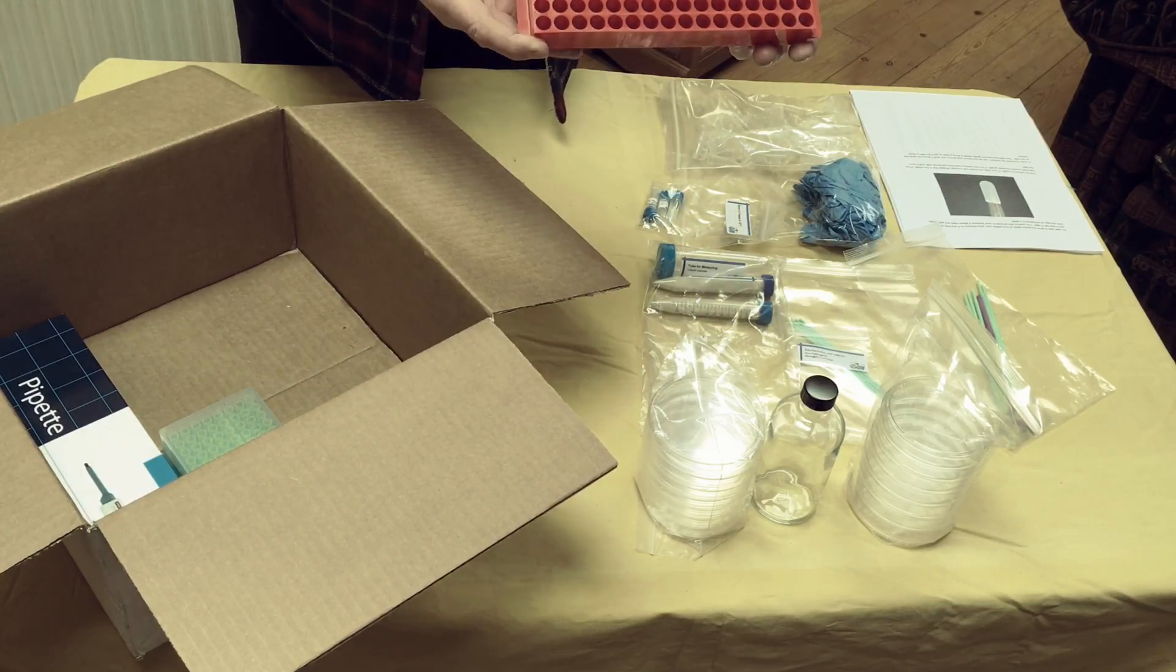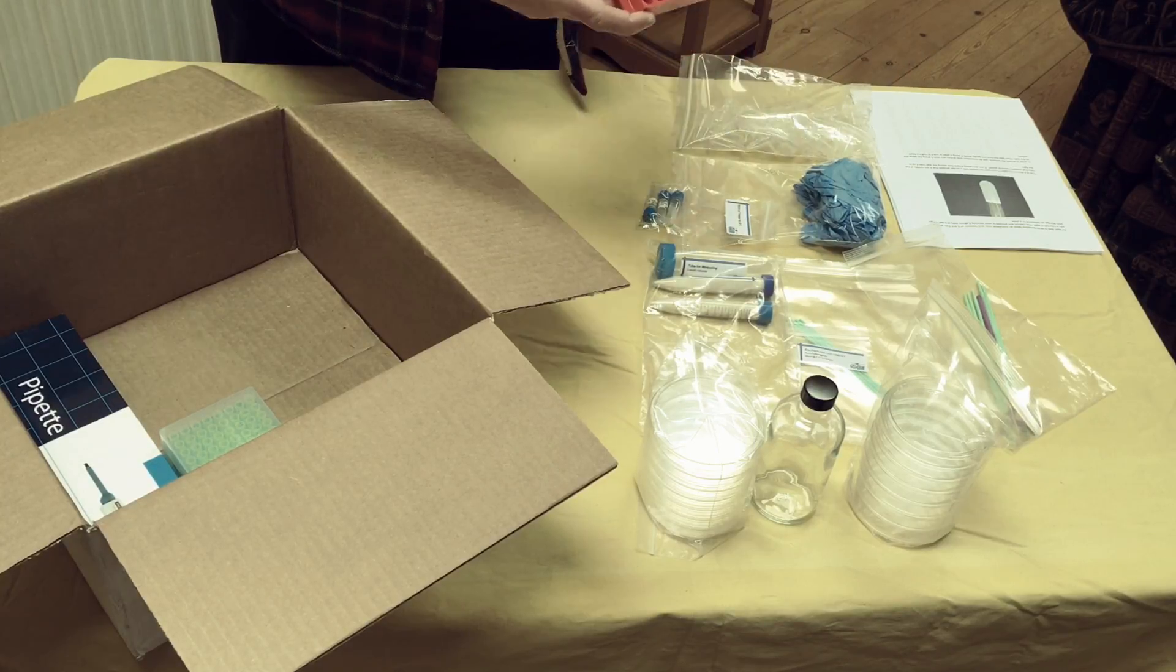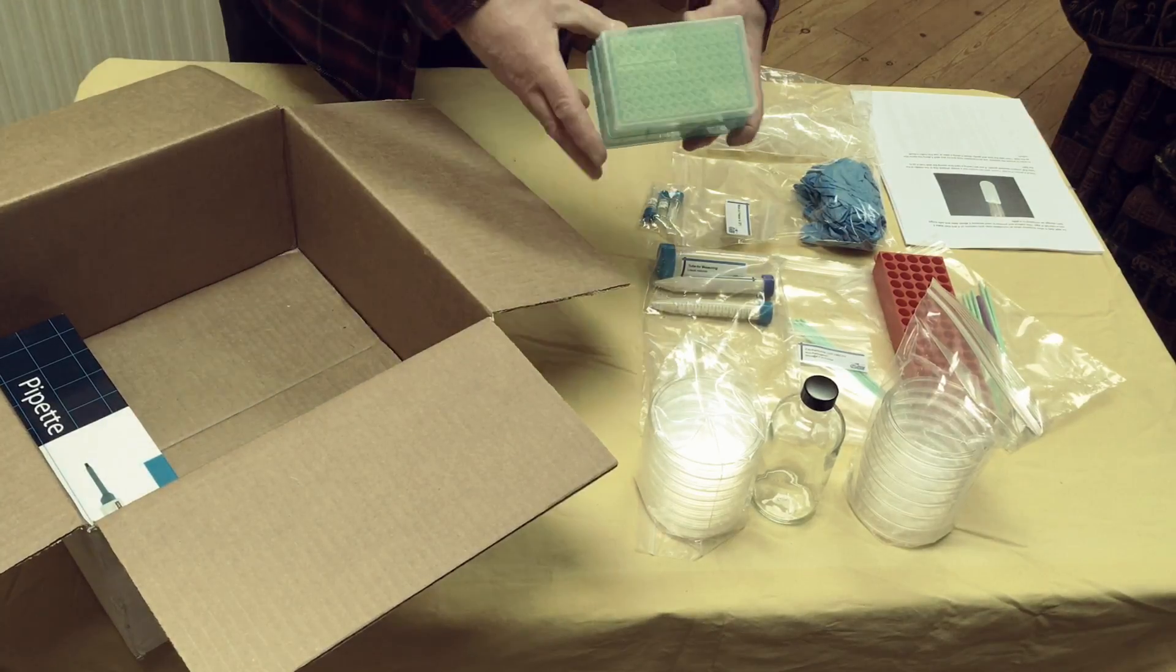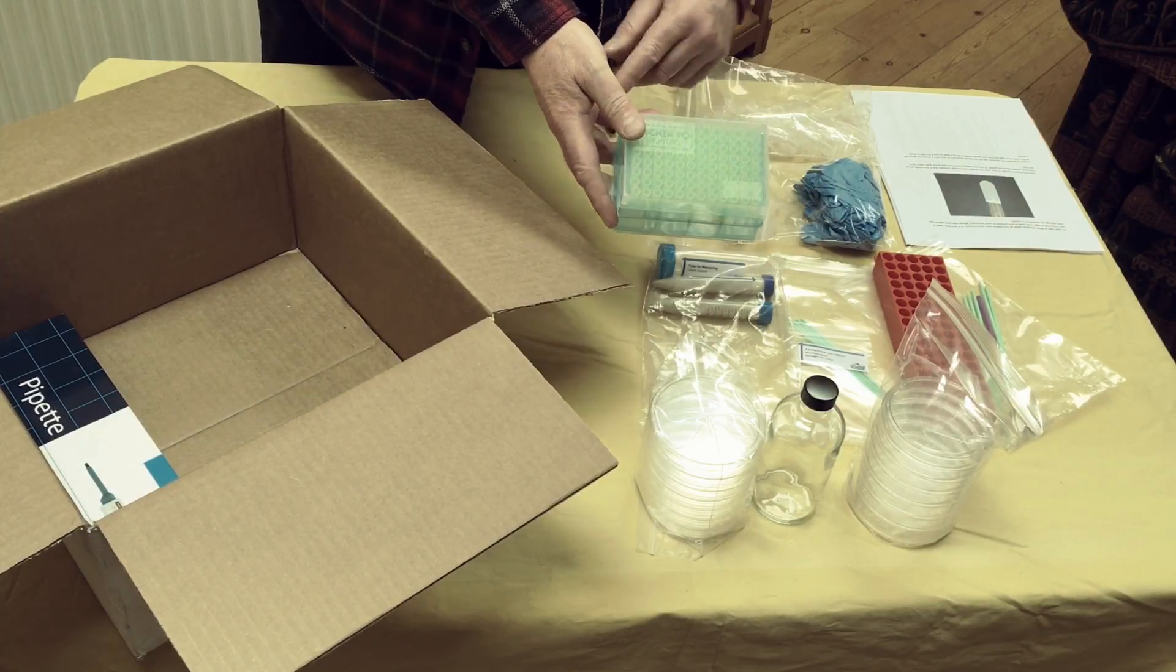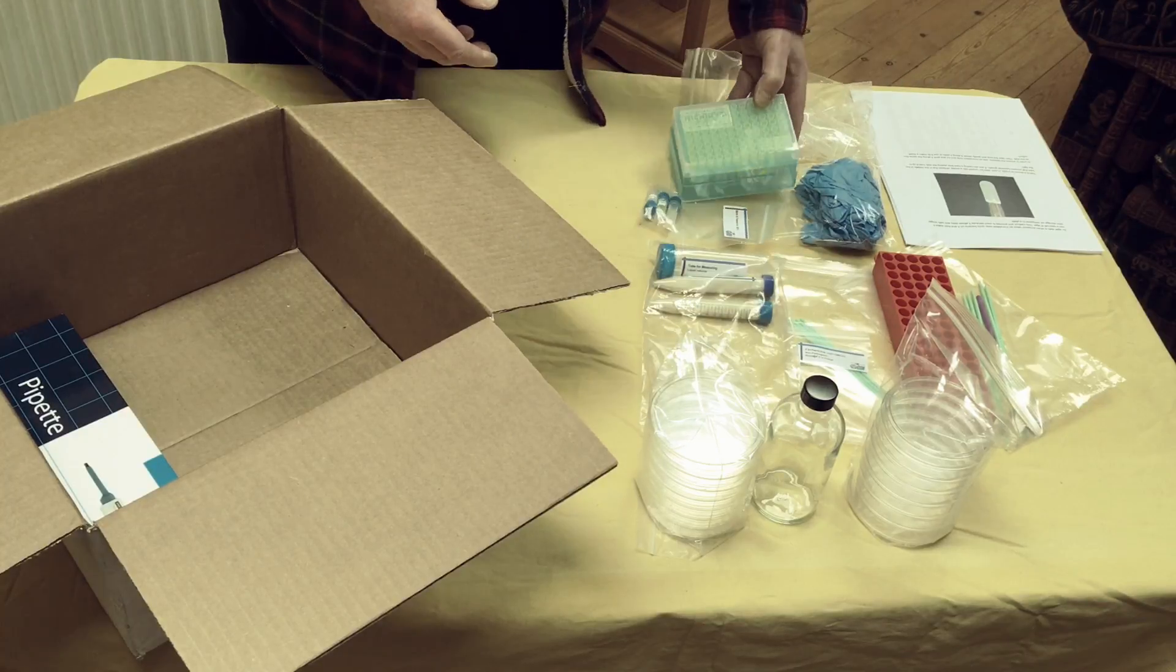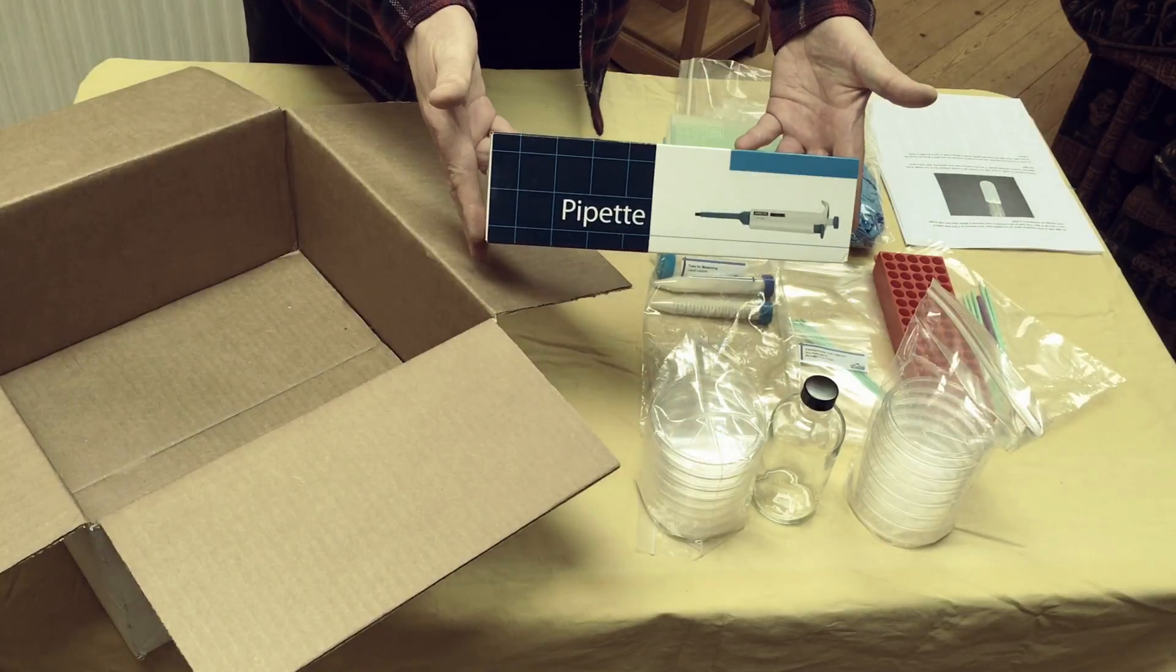Some kind of block for containing these little test tubes by the looks of it. Put all your samples in there. And another kind of block with lots of little test tubes in it. And a pipette.